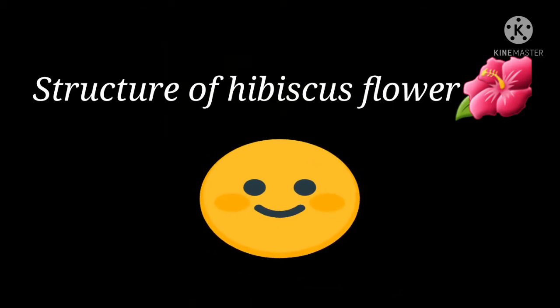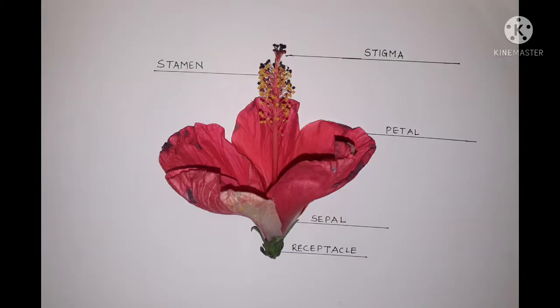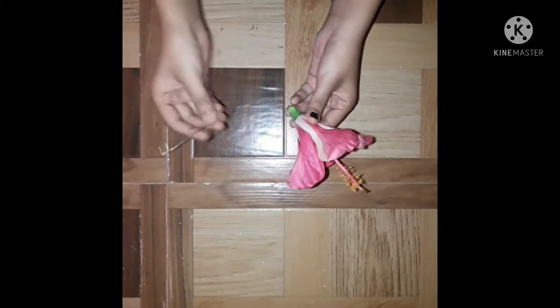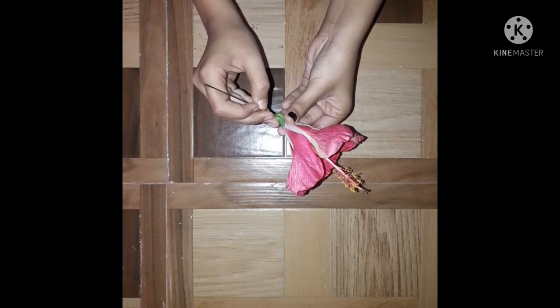So today I am going to discuss the structure of hibiscus flower. So here this is a hibiscus flower and now I am going to separate its parts one by one. First of all, I am separating the sepals, which is collectively known as calyx.